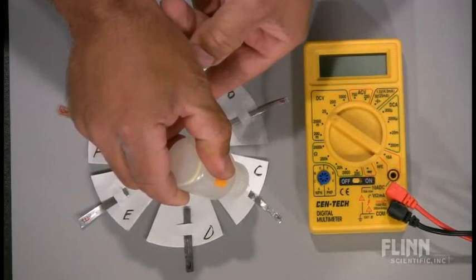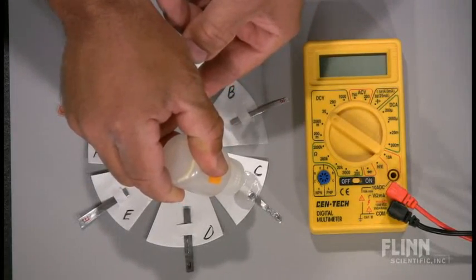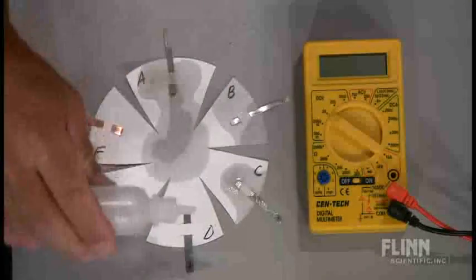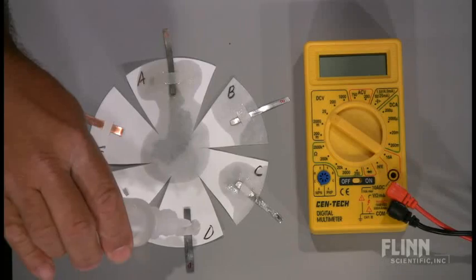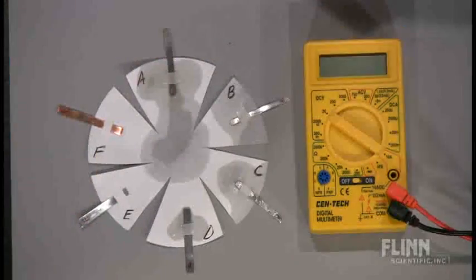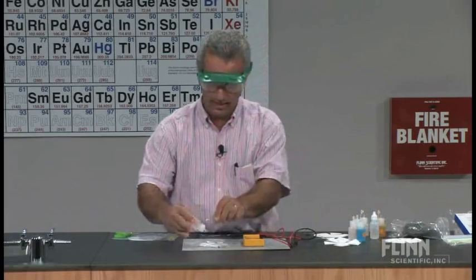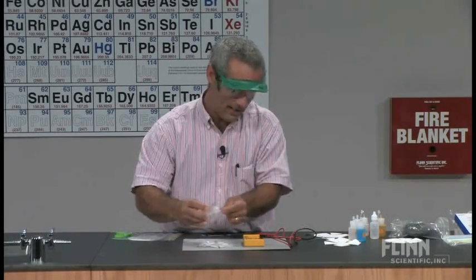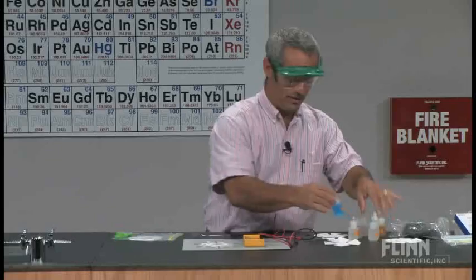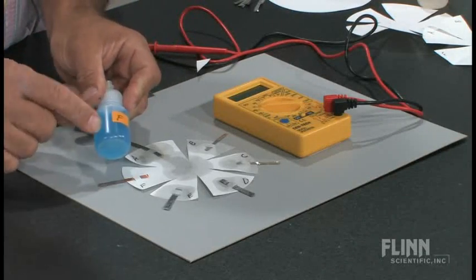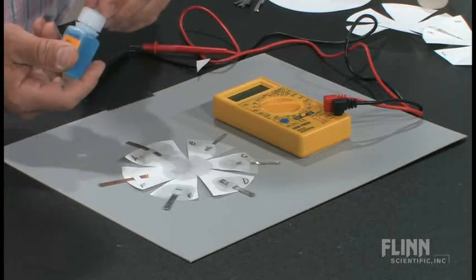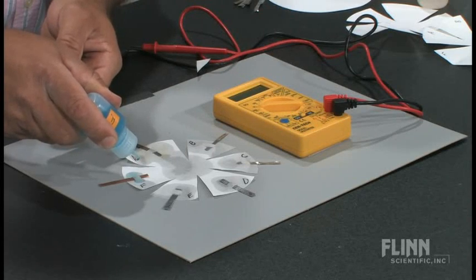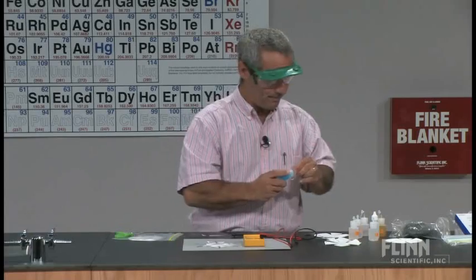Solution C goes on C. D on D. E on E. And F. You kind of have an inkling of what F is there, and this probably helps you, knowing that the F solution is colored. So we've got five drops of that there.